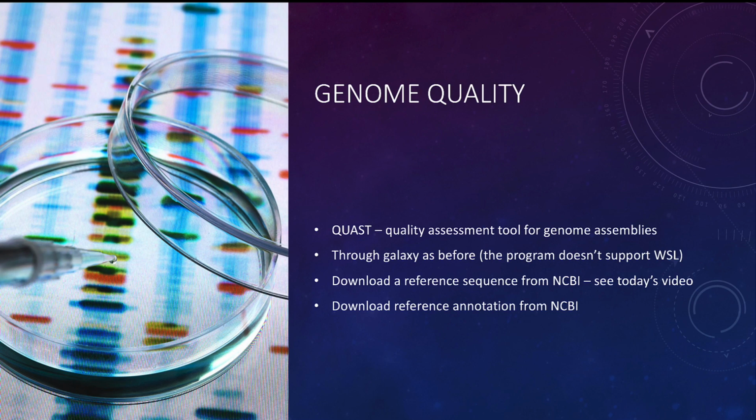And there are a couple different files that we'll download in order to help us do our quality assessment. That'll be a reference sequence from NCBI and a reference annotation from NCBI. And I'll show you how to do those things in a video where I show you how to do the assessment.